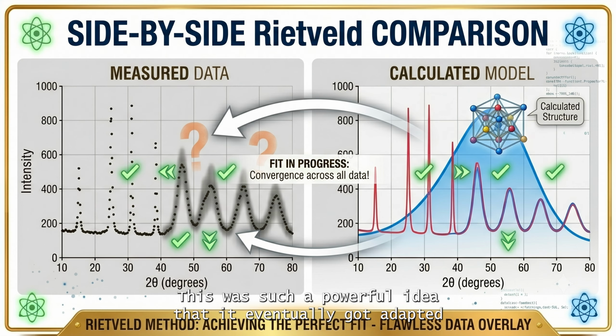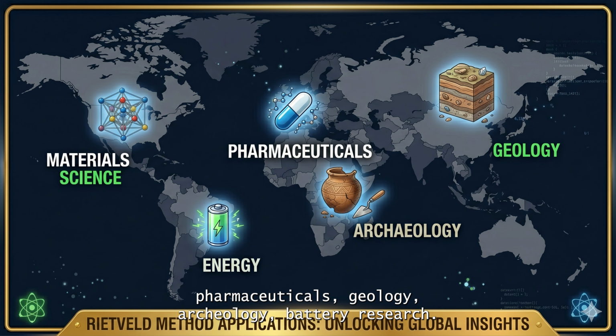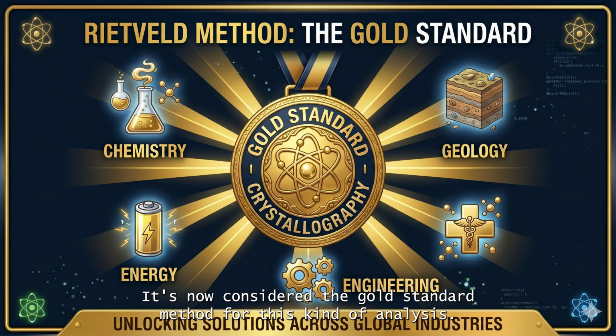This was such a powerful idea that it eventually got adapted from neutron beams to X-rays, and today it's used in materials science, pharmaceuticals, geology, archaeology, battery research. Basically anywhere someone needs to know exactly what's in a powdered sample and how it's arranged. It's now considered the gold standard method for this kind of analysis.